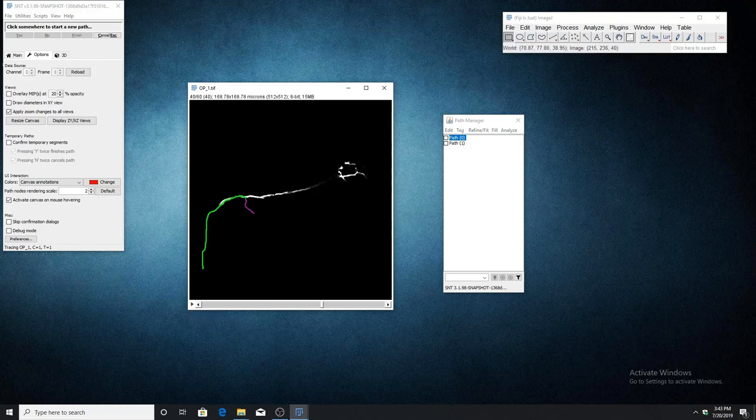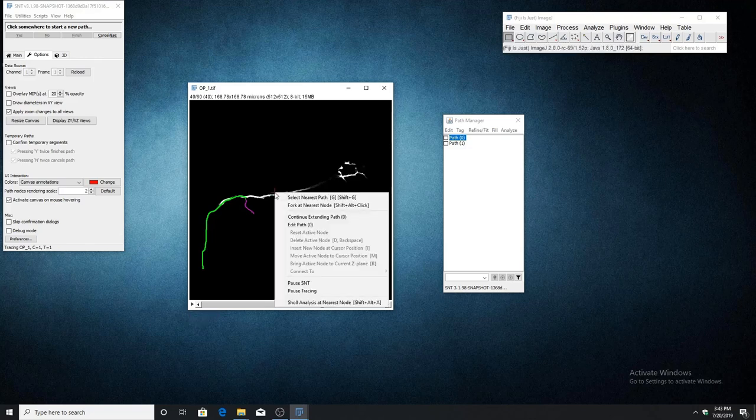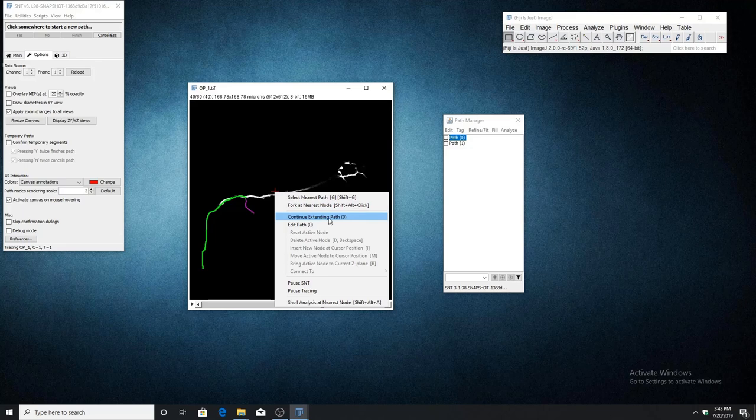Once the path is selected, open the right-click menu and choose continue extending path. You'll notice that the selected path is shown in parentheses.